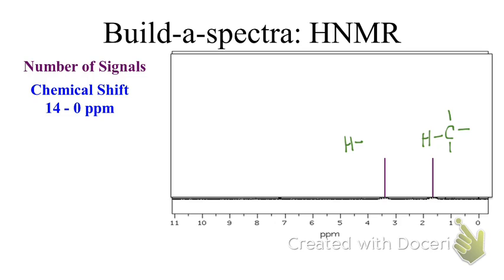At this point, we could continue to move through our HNMR, or we could realize that we have other information. What other information do we have? No, we don't have that information yet. That would be looking at the multiplicity. It's not up there.